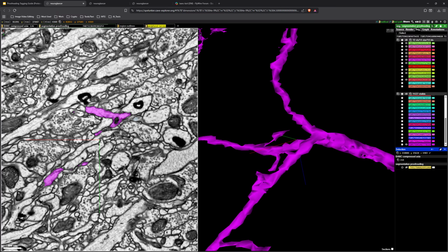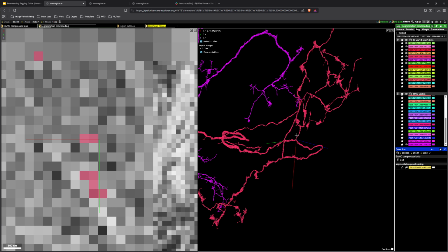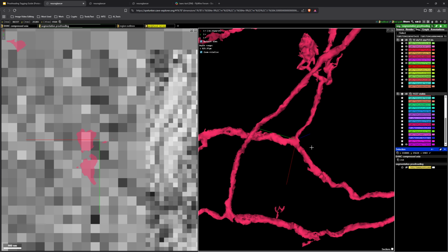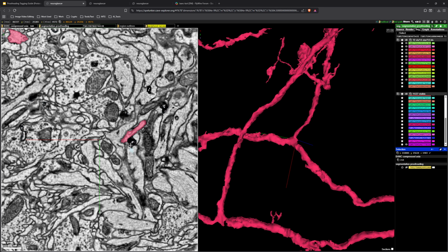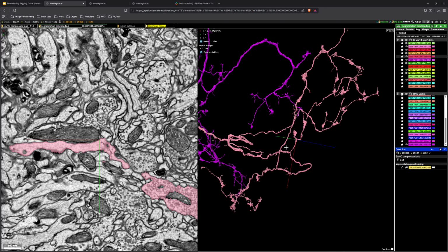Judging from where it is, so if we think about this thicker branch as the backbone, this thinner branch shooting off from the main branch, we know that anything that shoots off of the backbone is generally going to be smaller.